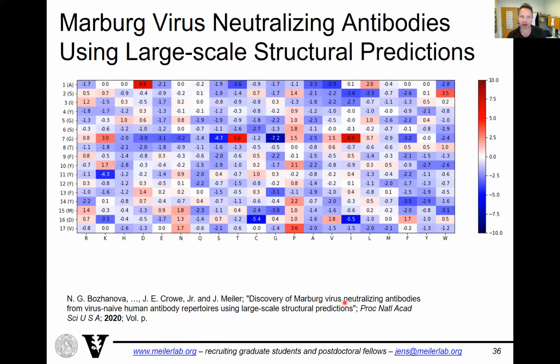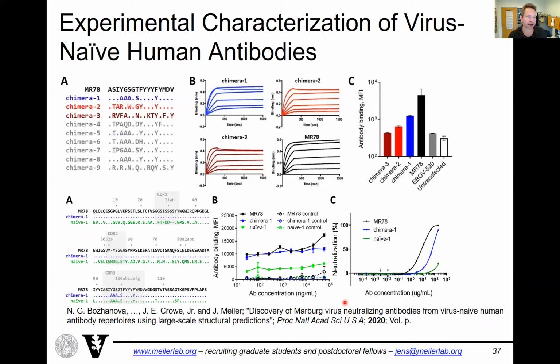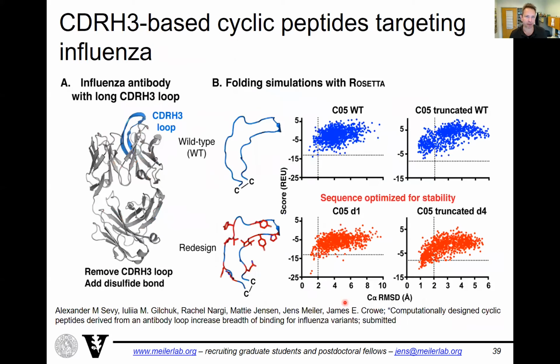for new antibodies that neutralize the Ebola virus or the Marburg virus in this particular case. These two viruses are connected. And so here we again went ahead and identified some of those exciting antibodies in humans that could be precursors to neutralizing antibodies for yet another viral infection. You could do the same for the SARS virus or for influenza. These are the same computational technologies that can be applied. And here is the structure of these antibodies that we determined in this particular paper.